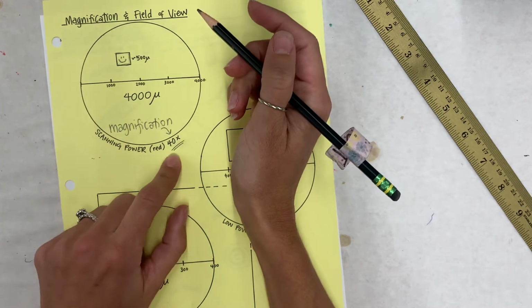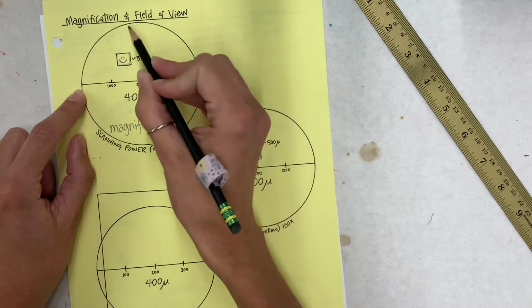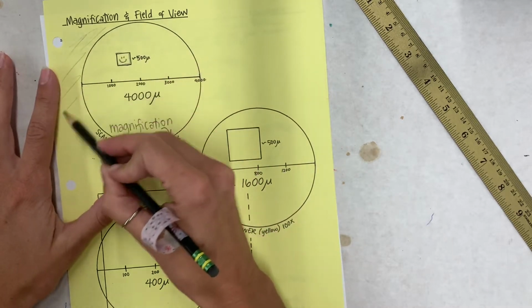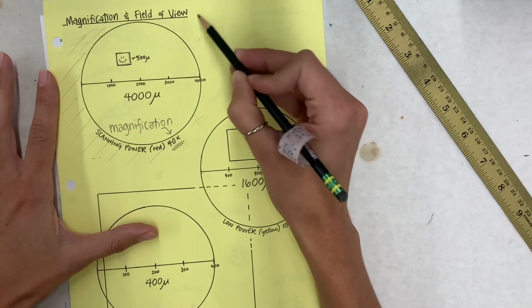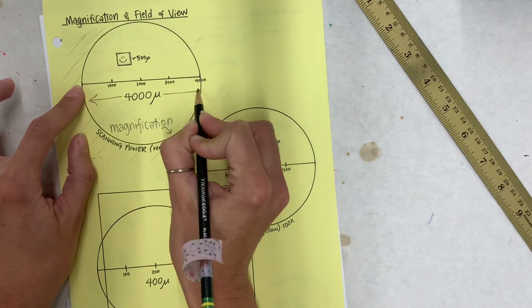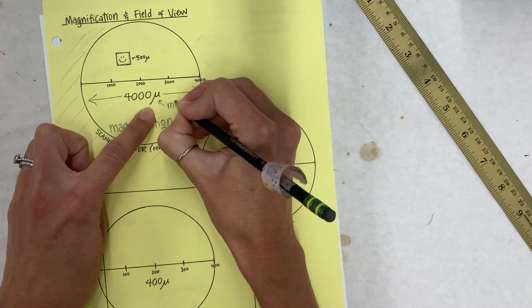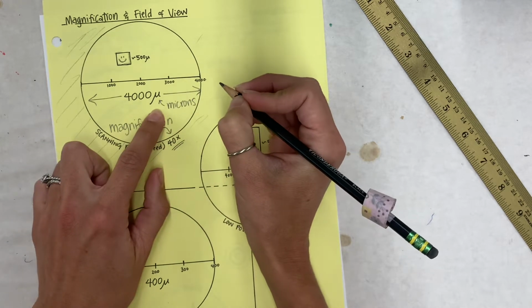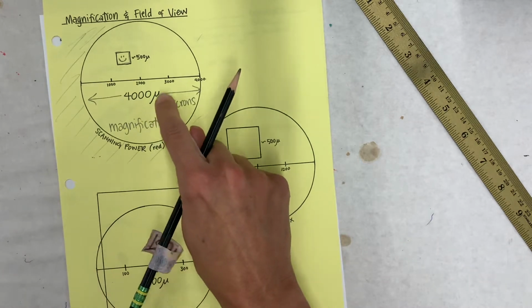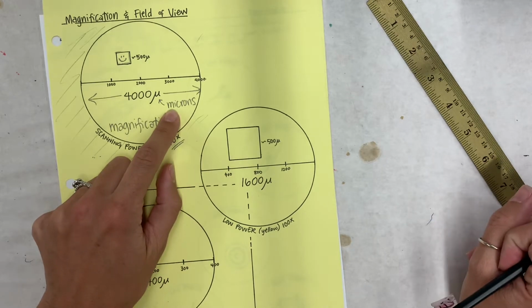At scanning power, 40 times magnified, we know the distance across our field of view. Our specimen is illuminated with the light shining through this circle, and then all around it is black. And across this field of view, which is a circle, is a known distance, which we know is 4,000 microns. So this unit here is known as microns, and that's what we're going to be using for our length today.